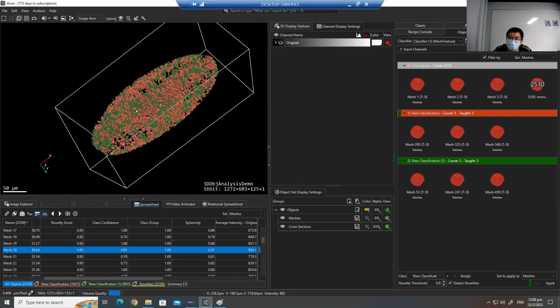That means the data here is not sufficient. You have to find something in between. There's something in between, which means I didn't provide enough training data. Maybe we need more. If the software finds something in between, something in the middle, it doesn't know where to place it. That means you need more training data.